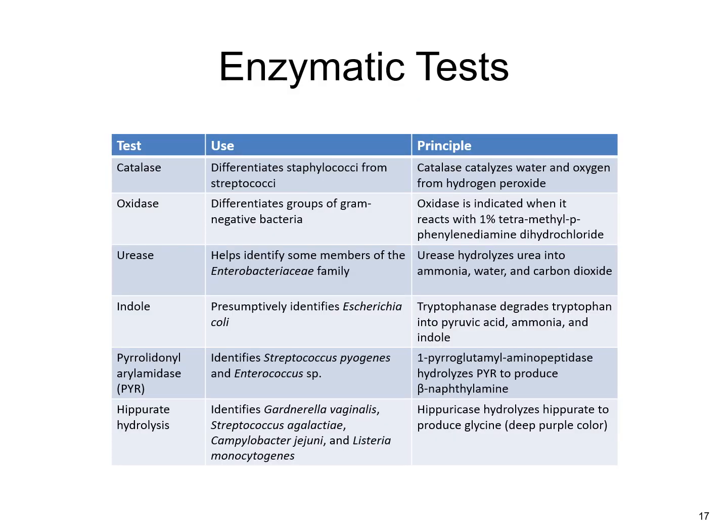There are several enzymatic tests that we use in the microbiology department to test some of the characteristics of these organisms. This chart lists some of the more common ones. We often refer to these as spot tests because we do them real quick on the bench and get an immediate reaction, so we don't have to let it incubate very long. So you may hear somebody refer to them as spot testing.